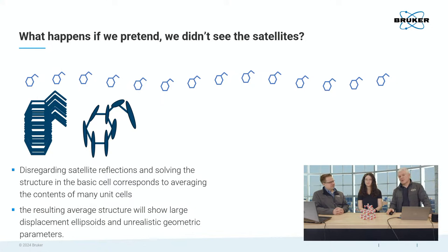as an average structure. And then you get, this little molecule will have typically bad thermal ellipsoids. The geometry will be bad. It just looks like an ugly giraffe. That's what I thought yesterday. Yeah, I mean, what's kind of interesting about that is, like you mentioned, thermal ellipsoids. This actually looks like it's a thermal vibration just in the one direction, right?